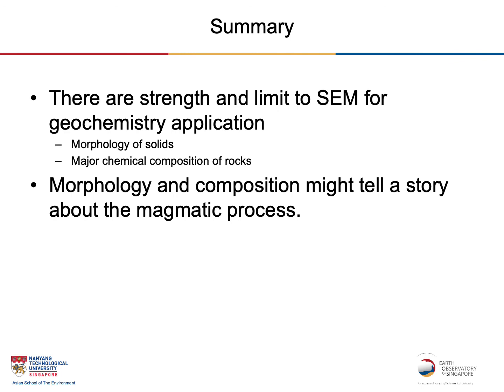So I'll just go straight to the summary of what we have discussed today. There are strengths and limits to the SEM for geochemistry application. It is good for morphology of solids and major chemical composition of the rock. By knowing the morphology and composition, it might tell a story about the magmatic process and what happened before, related to geological processes from the geochemistry.